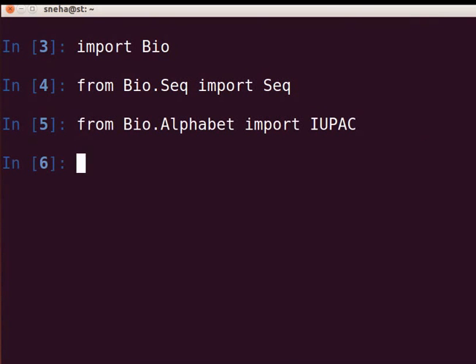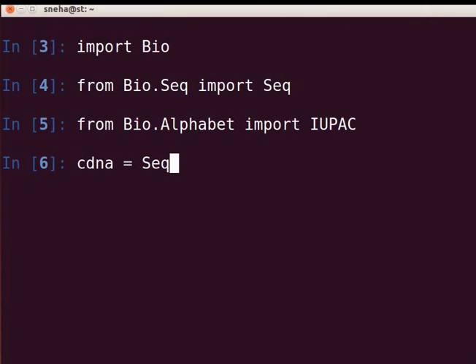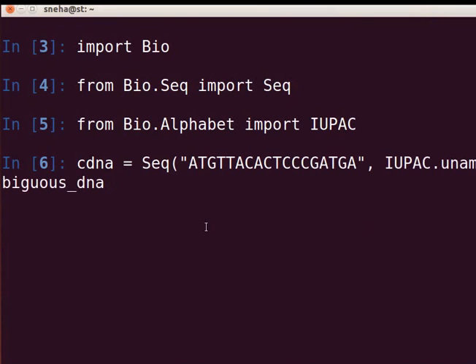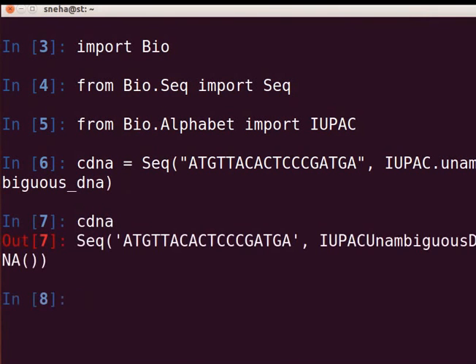Note that we have used import and from statements to load the Seq and IUPAC modules. Store the sequence object in a variable called cDNA. At the prompt, type 'cDNA = Seq(...)' enclosing the sequence within double quotes and parentheses. Since we know our sequence is a DNA fragment, type an ambiguous DNA alphabet object as an argument. For the output, type 'cDNA' and press Enter. The output shows the DNA sequence as a sequence object.